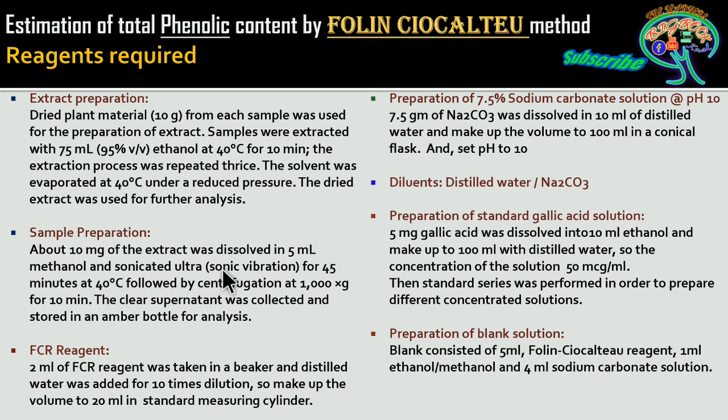Here we are using a technology with ultra vibrations, so the dissolving of the sample is going to be very quick.